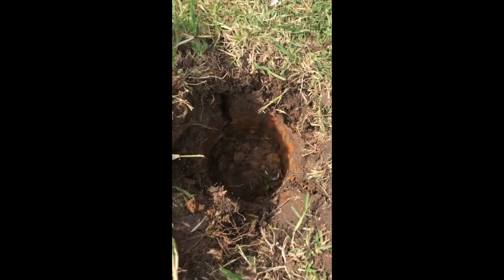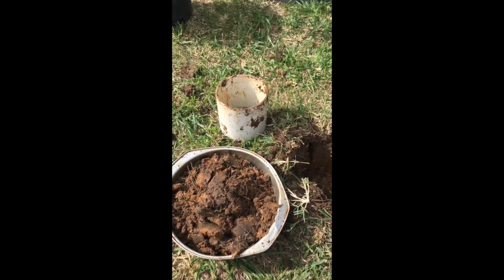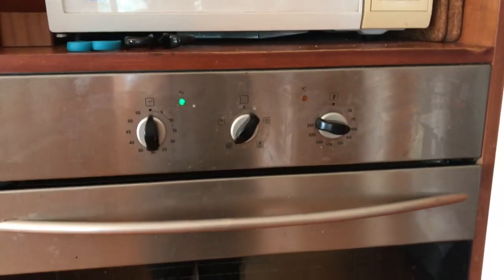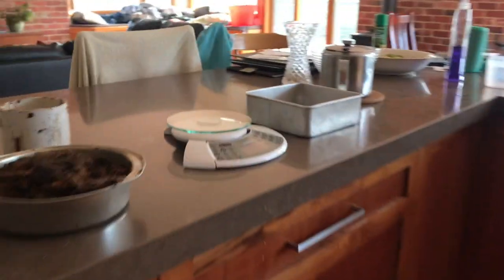Alright, so we've gone from this, to this, to this. We now have our mud pie, and we're ready to take it inside and weigh it, and then bake it. Let's go! Hopefully by now your oven will have preheated, so we can get ready to put our sample in there as soon as we give it away.